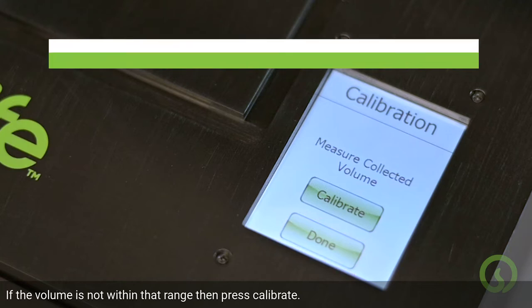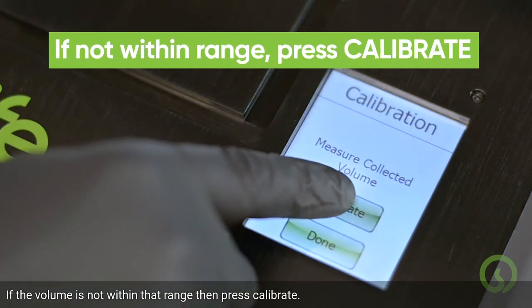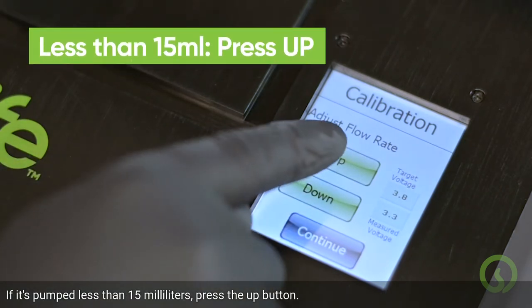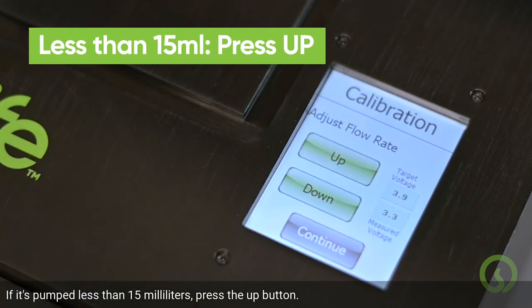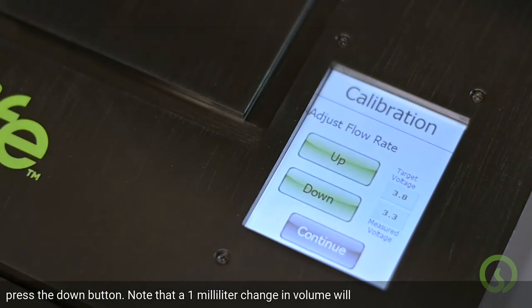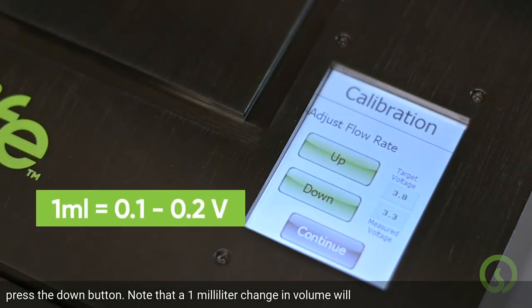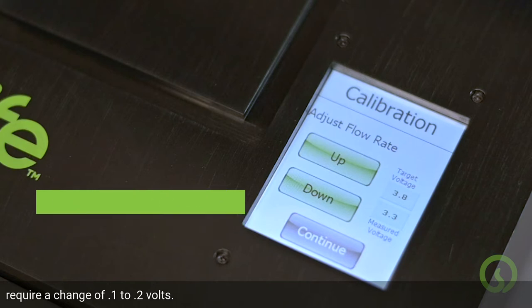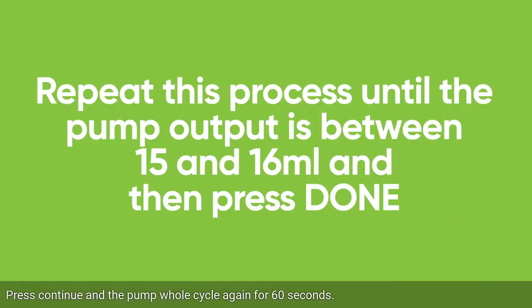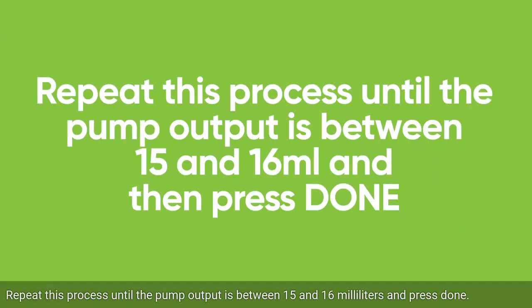If the volume is not within that range, press Calibrate. Here you can adjust the flow rate up and down by adjusting the voltage to the pump. If it has pumped less than 15ml, press the UP button. If it has pumped more than 16ml, press the DOWN button. Note that a 1ml change in volume will require a change of 0.1 to 0.2 volts. Press CONTINUE and the pump will cycle again for 60 seconds. Repeat this process until the pump output is between 15 and 16ml, then press DONE.